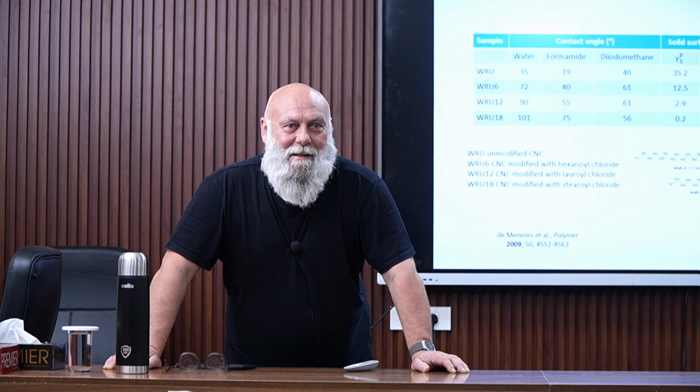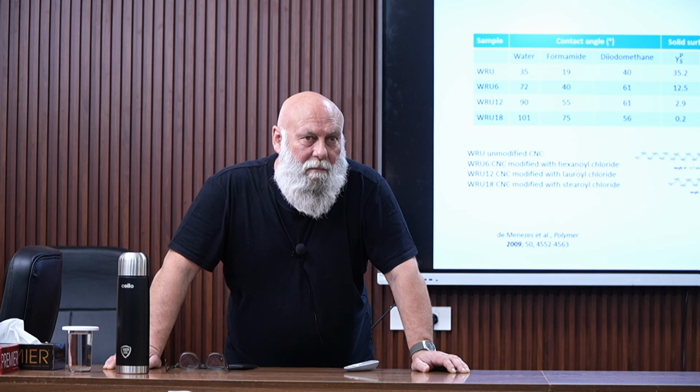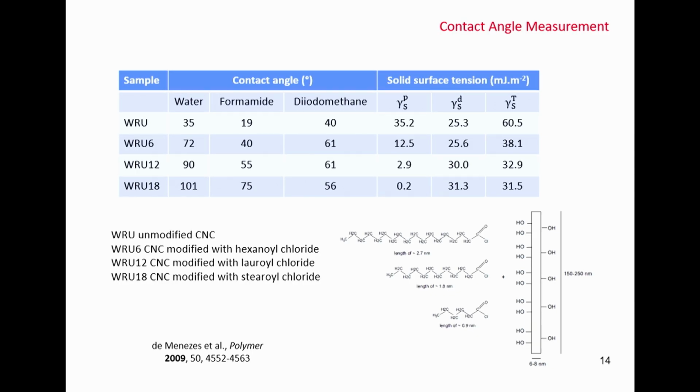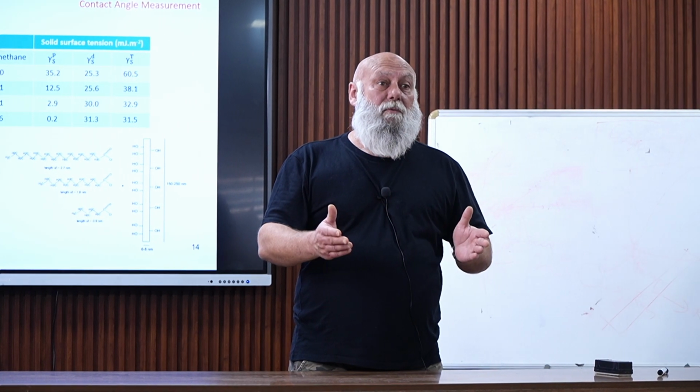Sir, my question may be silly, but in most of the TG instruments, I have seen that we use an inert atmosphere. But in one of your slides, it was mentioned that we can use air as the atmosphere itself. Yes. Usually nitrogen atmosphere is used, but we can also use air atmosphere. What is important is that if you want to compare your sample with other samples, it's necessary to have the same atmosphere, of course.